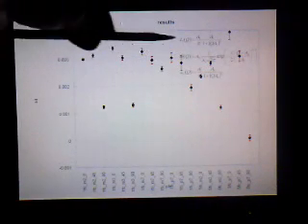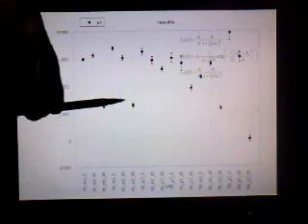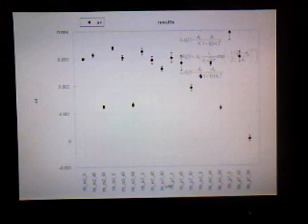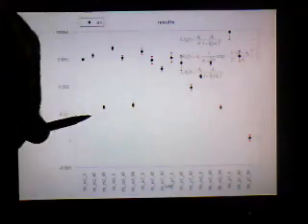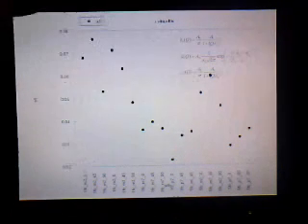This is information about the half-width. Again, there is some systematic behavior here as well. This is information about the position of that bulge, and it's pretty consistent at about 0.003. However, when you get to the very high field, you see it starting to push to small q, which is consistent perhaps with the periodicity of stripes or whatever creating this kind of signal. Remember, a peak means periodicity. This periodicity becoming larger. This is now the amplitude of the Lorentzian representing the bulge.